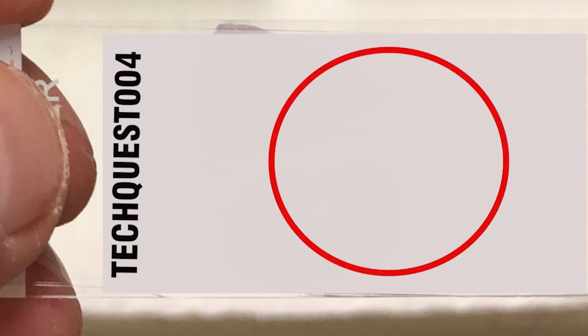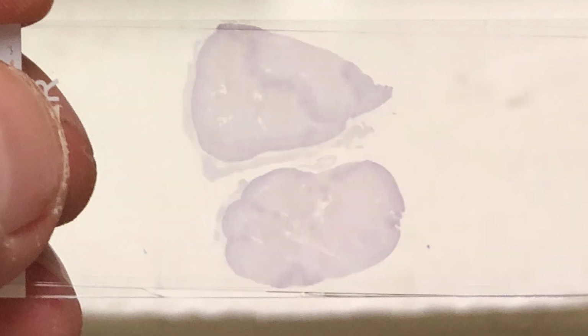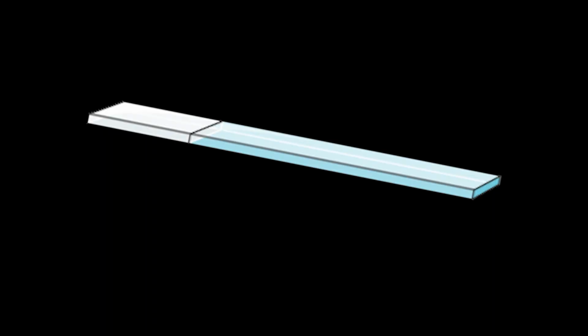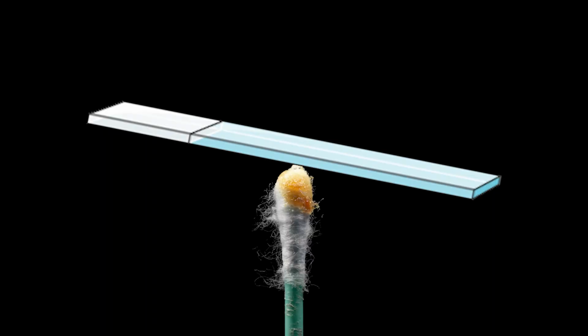Generally, specimens are placed on a slide using a swab containing patient material. To avoid contamination of culture media, once the swab has touched the surface of the non-sterile slide, it should not be used for subsequently inoculating media. The swab should be rolled onto a glass slide and not just rubbed.